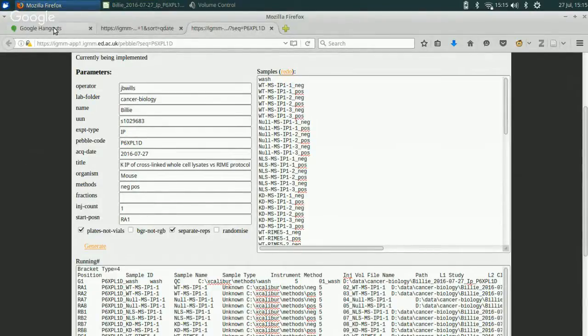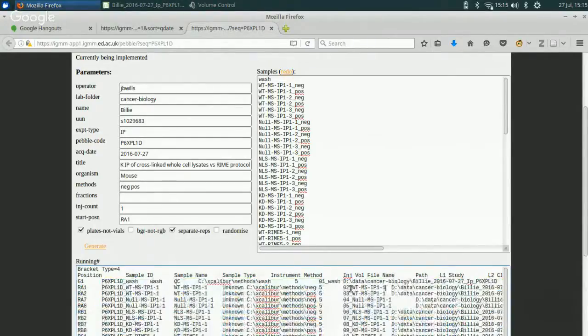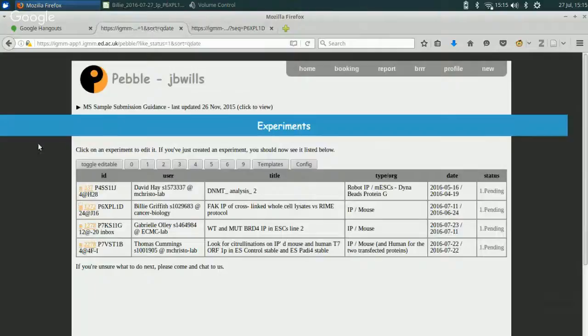And I hope that the audio is still working, because the last time I tried this, it was awful. So what was the thing I had to fix? Oh yeah, we have to put the method onto the end of the file name when there are different methods used. I'll do that. And in the meantime, I hope that this works nicely for everyone.